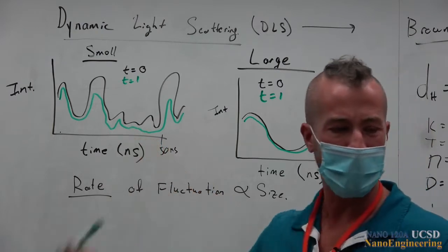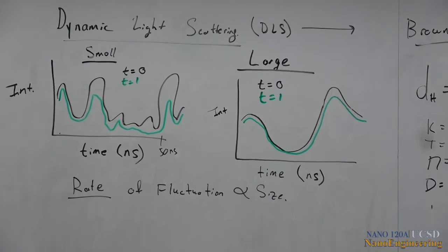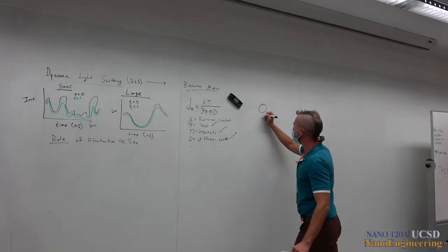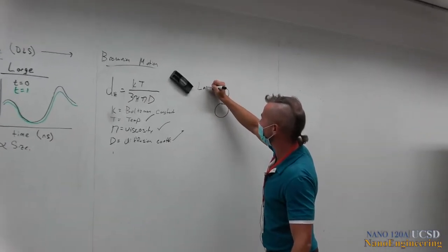Let me actually explain a little bit more about how we're getting this. Let me do it over here. Imagine that you have two particles. Laser hits them.